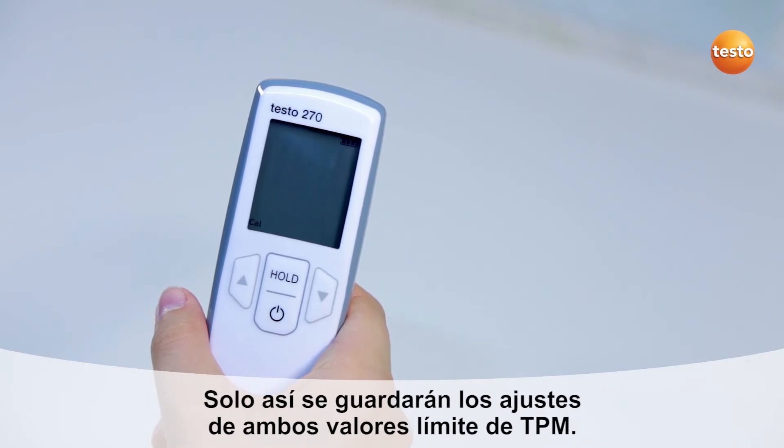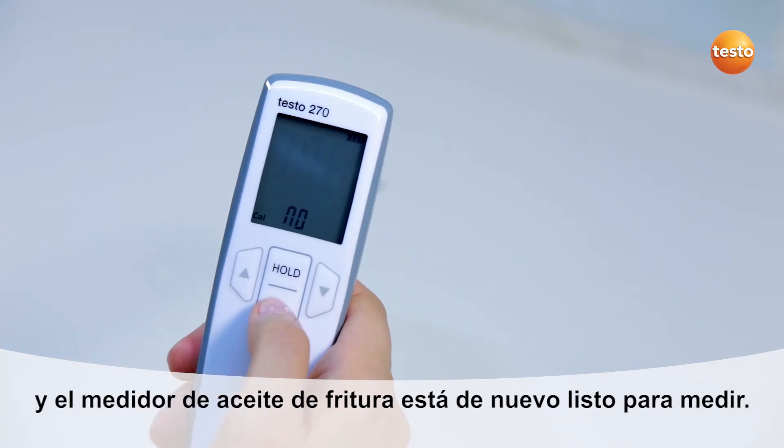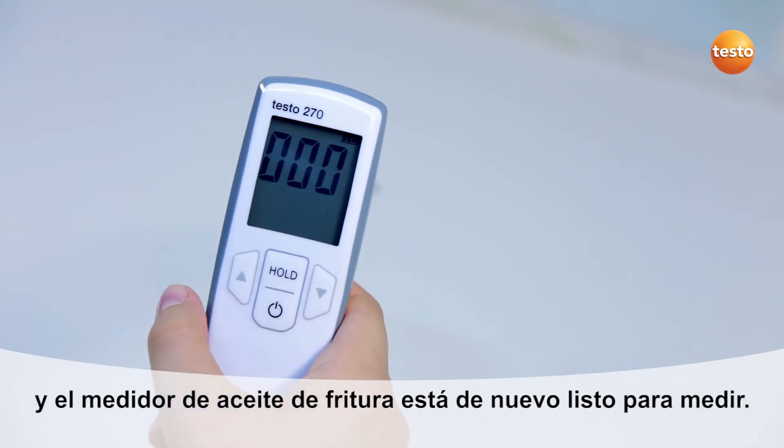Only then are the settings for both TPM limit values accepted. I exit the configuration menu with the on-off button and the cooking oil tester is ready for measurement again.